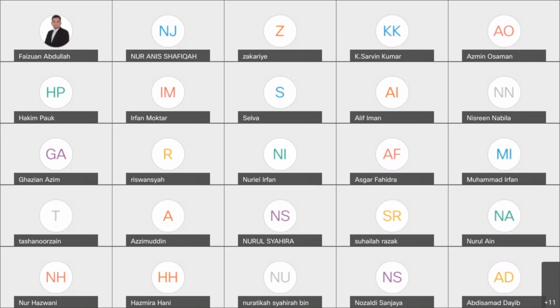All right, for this week or for today, we're going to learn about the gas chromatography. Have you all watched the videos that I have uploaded in the e-learning? Yes. Okay, what have you learned from the video? Can you tell me something?